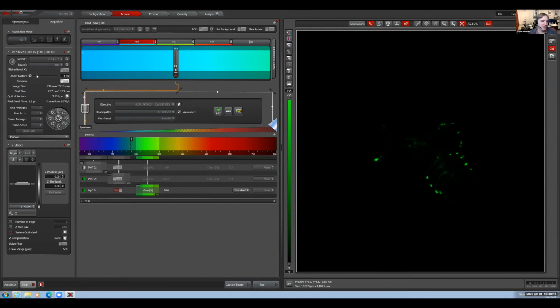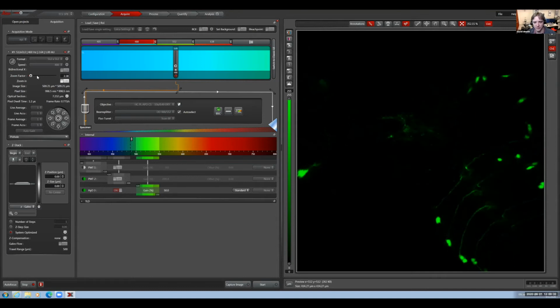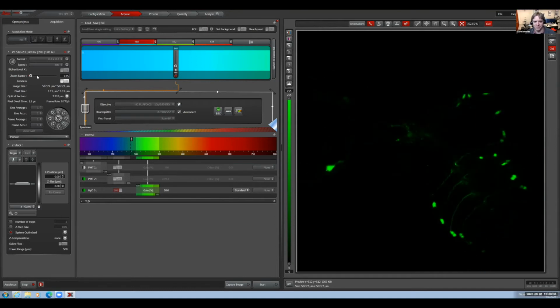If you either mouse wheel on that and slowly increase. The other thing is you should have a control panel right under the monitors with 5 or 6 dials on it, 6 dials. Yeah. Oh, there's the zoom. Yeah, totally. Zoom is there. If you just spin that one to the right, it'll actually zoom us right in on the center of the image. Okay. And there's quite a few controls on that dial, and that dial is actually customizable. Yeah, so zoom, pinhole, smart offset, and smart gain.